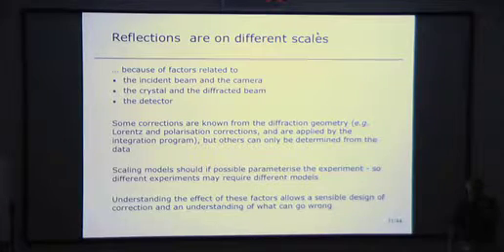And what we're really trying to do with the scaling model is we're trying to parameterize the experiment. We're trying to divide up the experiment's parts so we can account for the changing effects of each of those parameters during the course of the experiment. And of course, a different experiment may require a different model.